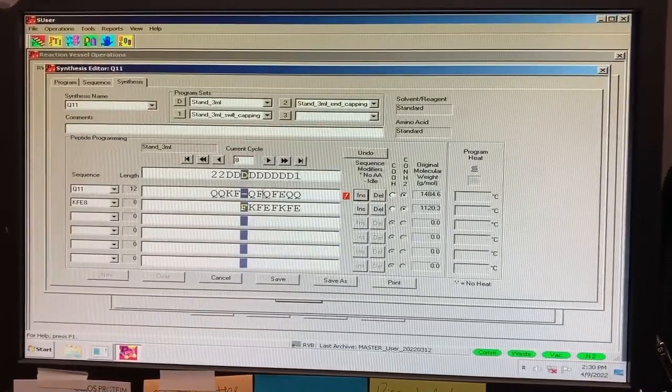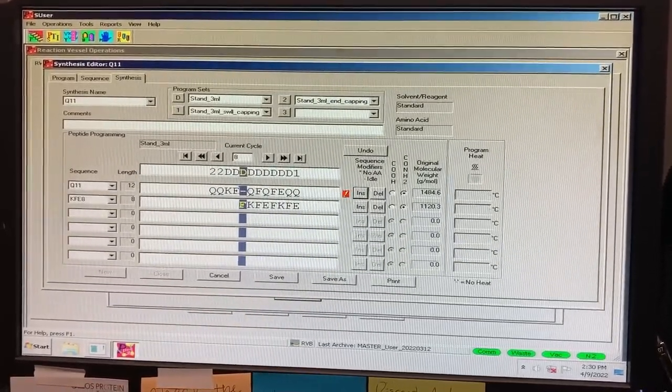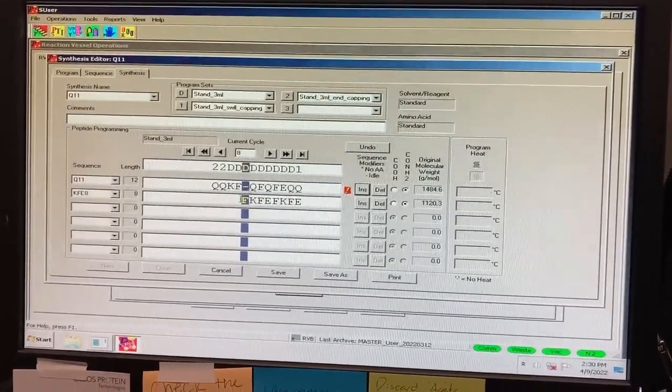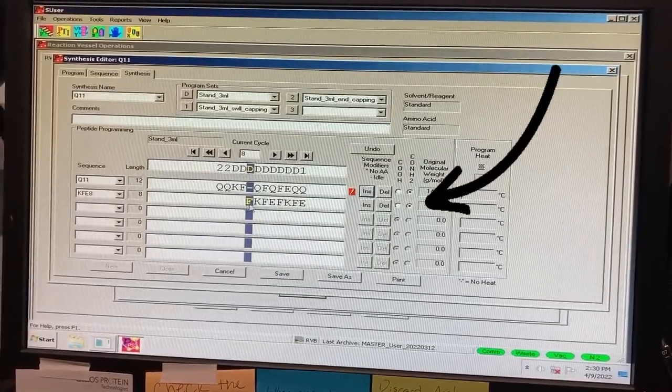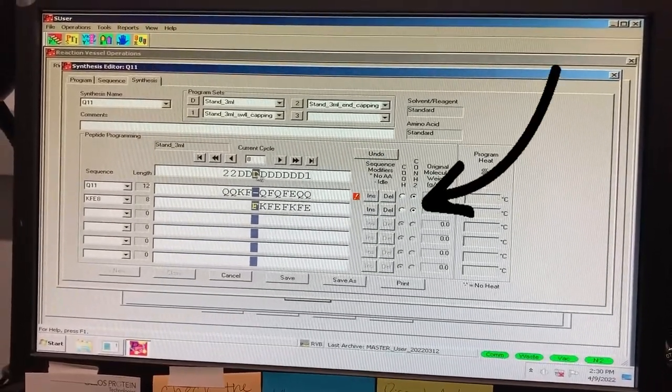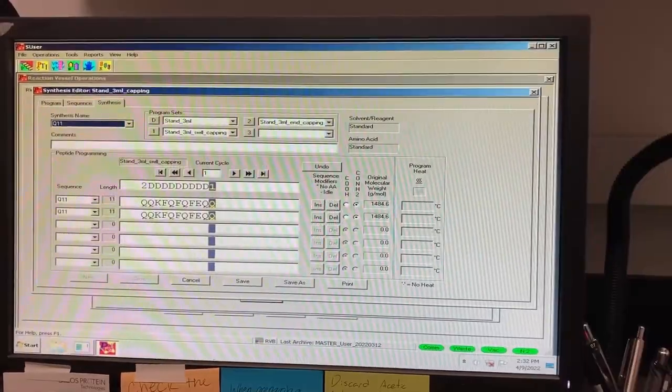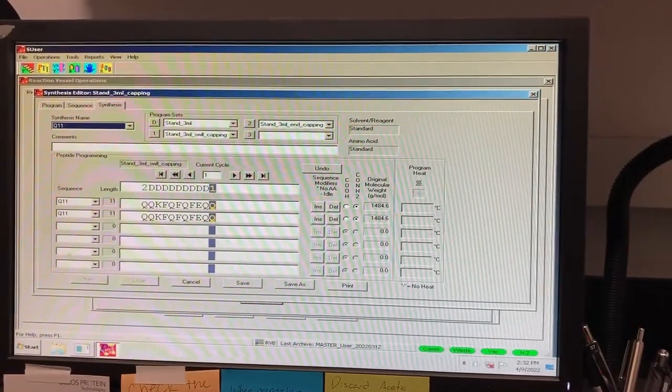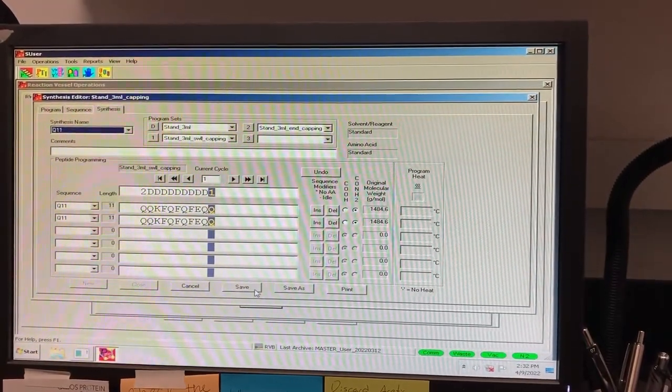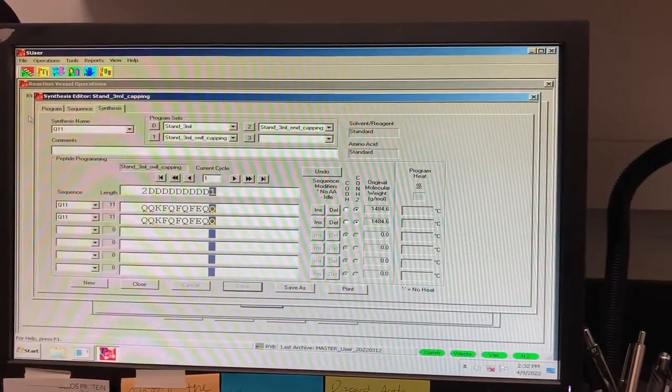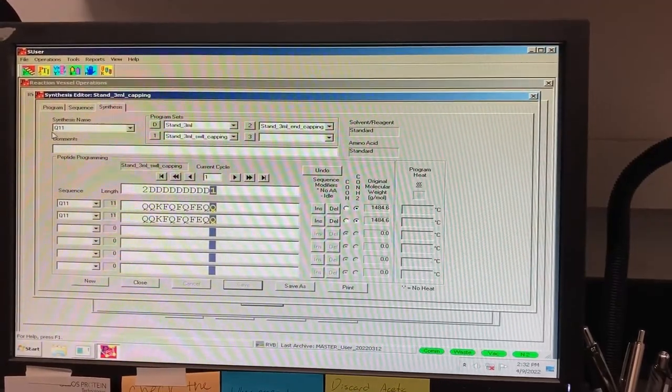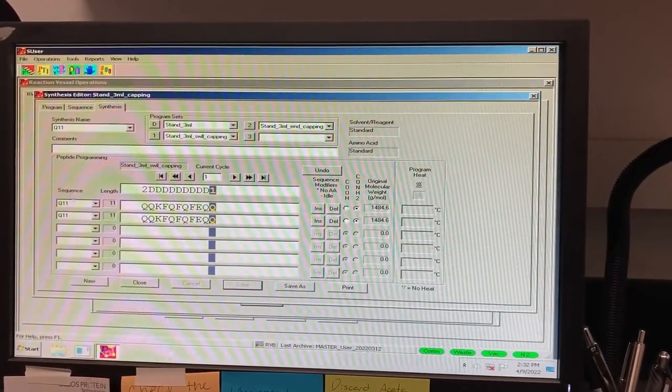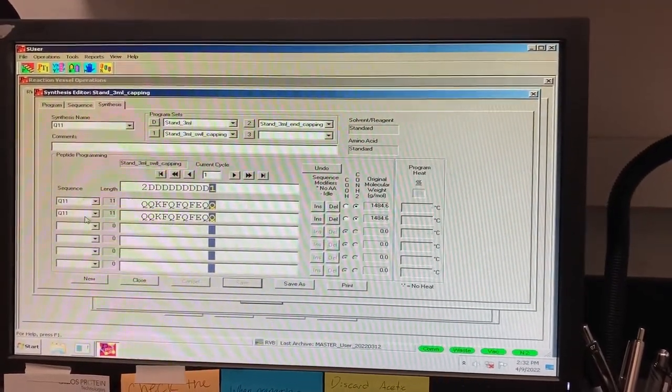Once you are satisfied with the sequence of program sets, make sure that the CONH2 option is selected. When you are done, you can either save your edits to the current synthesis file, or save the instructions as a new file. In this example, we are saving the sequences and program sets we selected to the synthesis file, so that now, when we open the synthesis file, this is the preset.